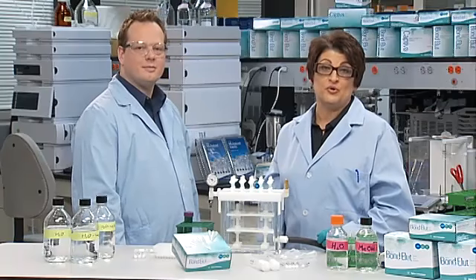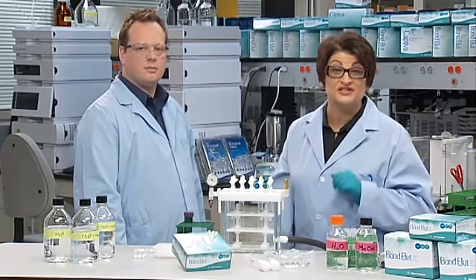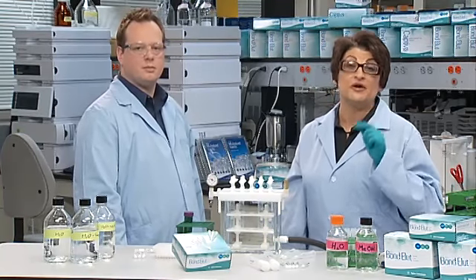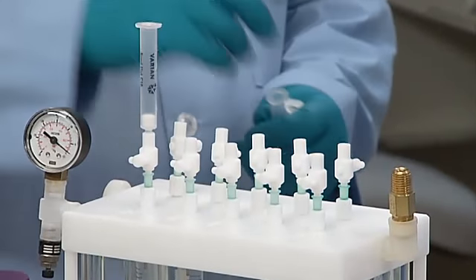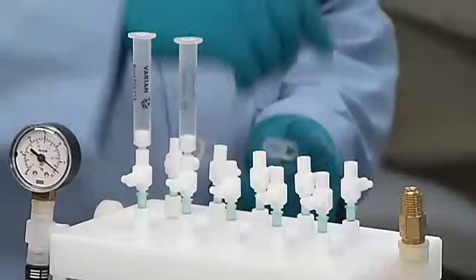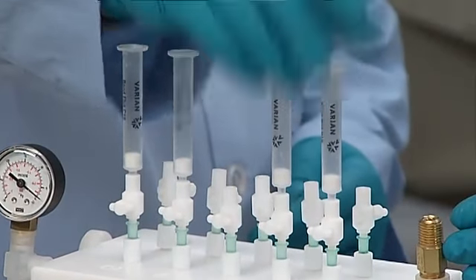Well said, Ben. Keeping these two important steps of conditioning in mind, let's take a look at the results of a poorly conditioned SPE cartridge in comparison to a properly conditioned cartridge. We have here 4 3-milliliter cartridges containing 100 milligrams of C18 SPE material.